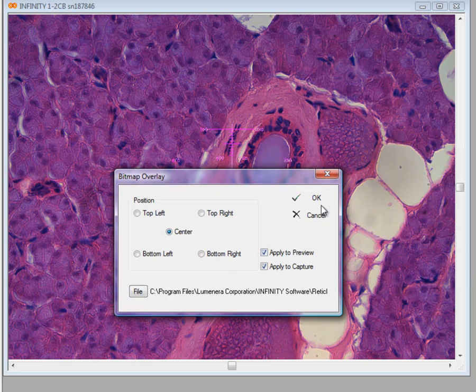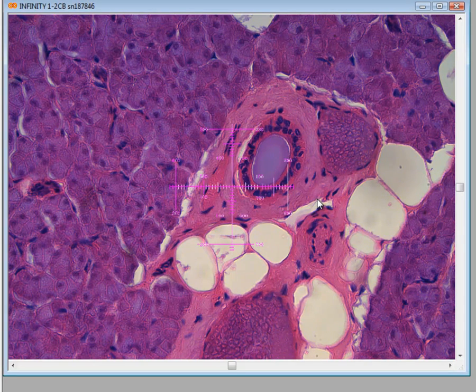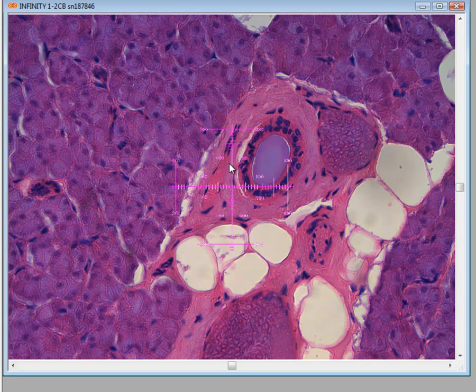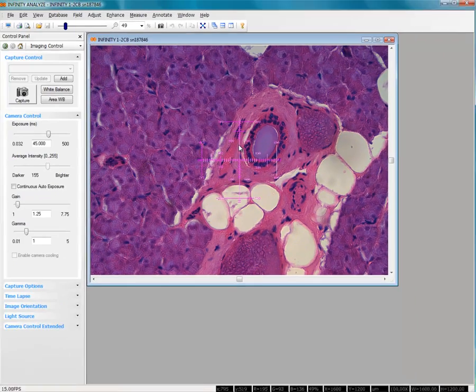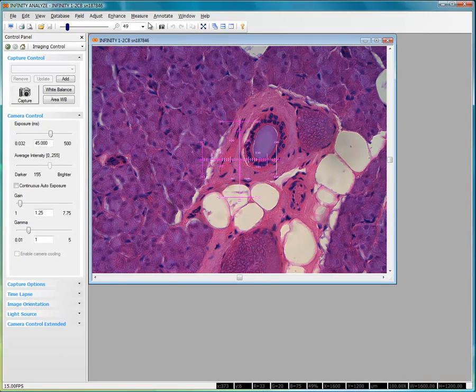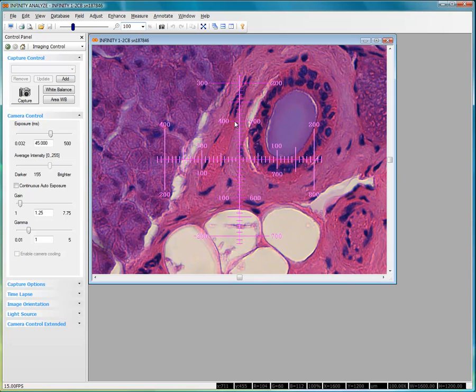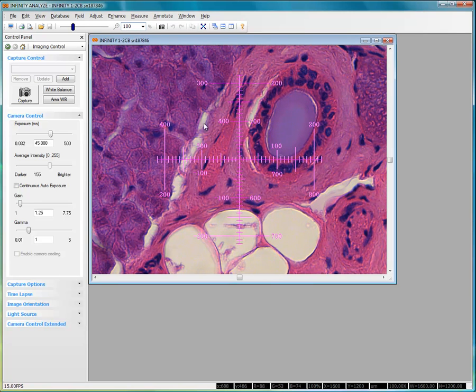Here a cropping from one of the Luminera supplied reticles has been displayed in the center of the image. And changing my zoom preview to 100%, you can see that all the detail from that bitmap overlay is displayed on my image.